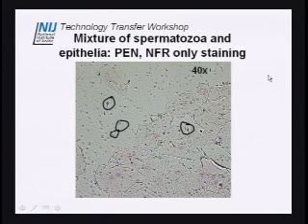And what staining did you say you use? This is nuclear fast red staining only. This is with your Christmas tree stain, but it's just the red. So you're not using the picroindigocarmine? No green. No green. Okay.